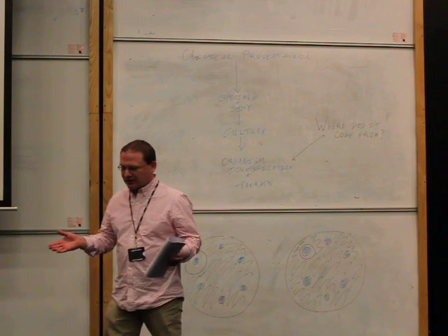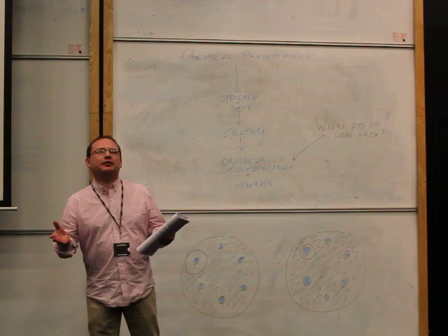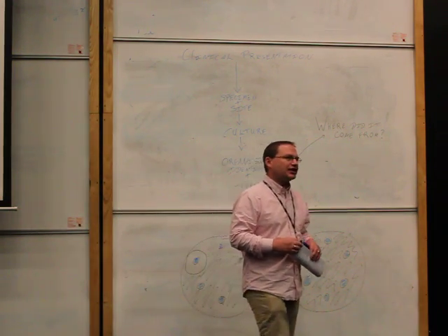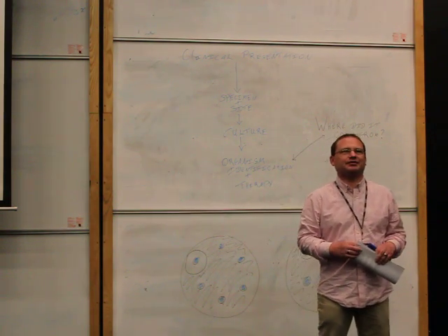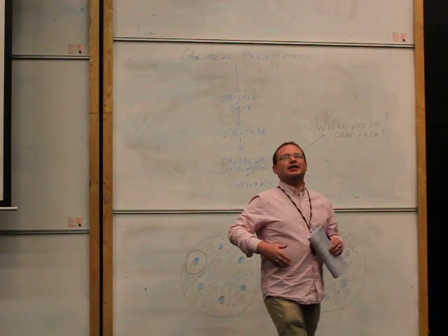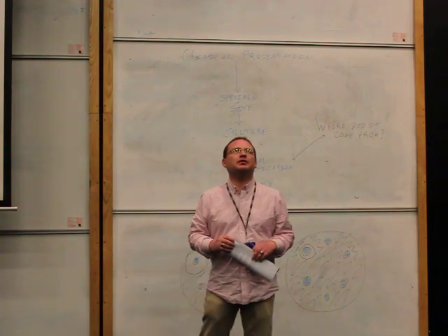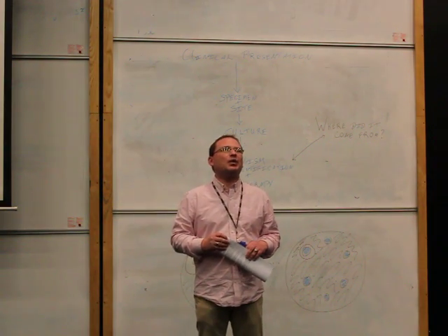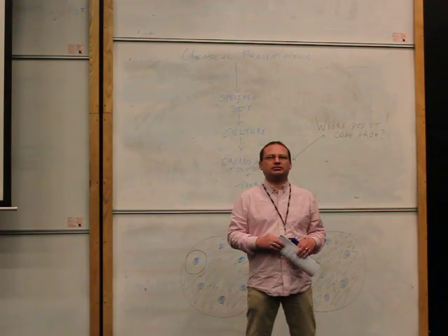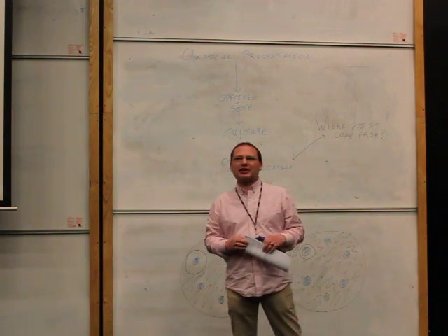So let's screen the other sites. You've identified those sites. Marvellous. These swabs have been cultured, and lo and behold, we've isolated a Staphylococcus. What we would like you to do in the laboratory, going through pictures and videos that we've set up over the past couple of weeks, is identify what type of Staphylococcus this baby is carrying. That make sense so far?